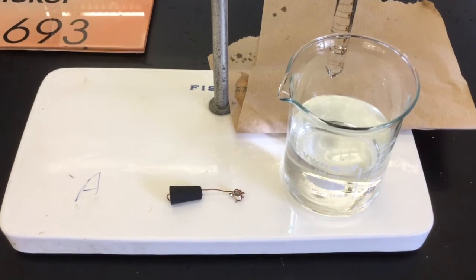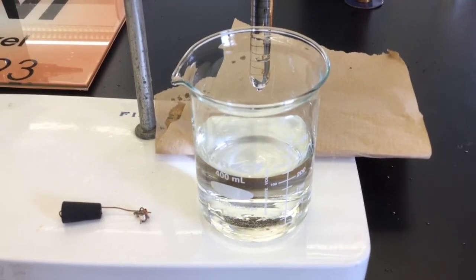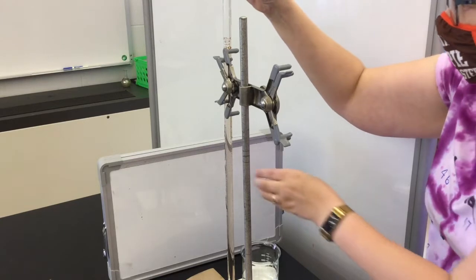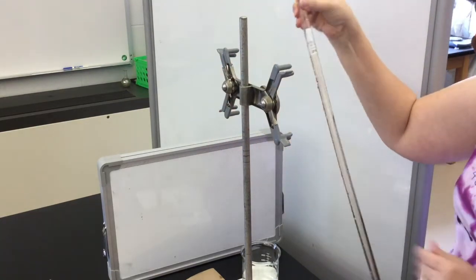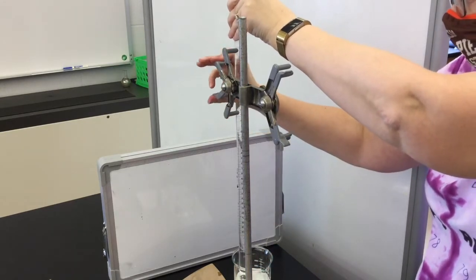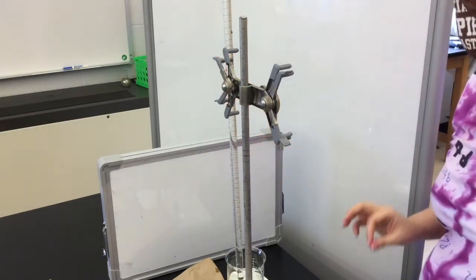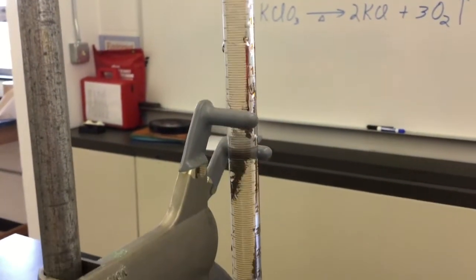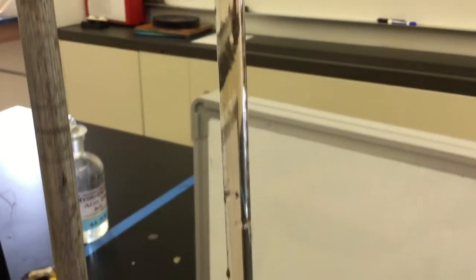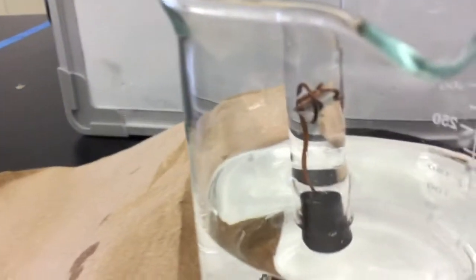When you add the magnesium to the diluted hydrochloric acid in the eudiometer, you will find that the reaction will begin right away, so you want to make sure that you have your large beaker with water ready to go. Invert very quickly, and then after you invert, insert it directly into the glass beaker to ensure that any bubbles formed stay in the eudiometer and any displacement occurs into the water, which will offer some reverse pressure. You may notice some turbidity in the eudiometer as the hydrochloric acid drips down — it's a little bit more dense than the water — and then it will reach the magnesium strip, which will begin to form bubbles.